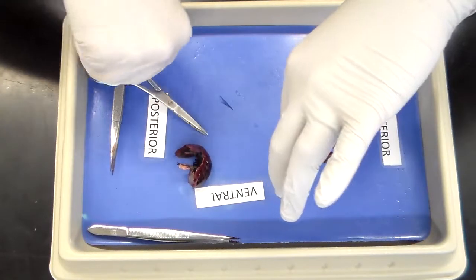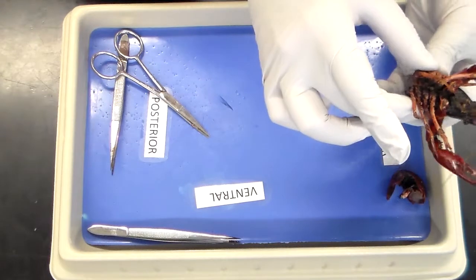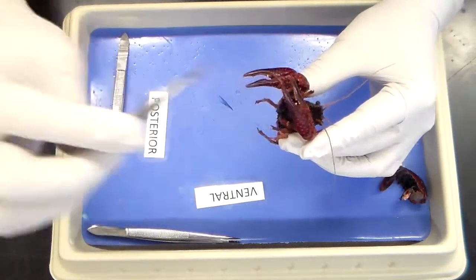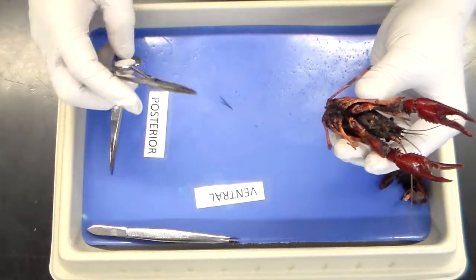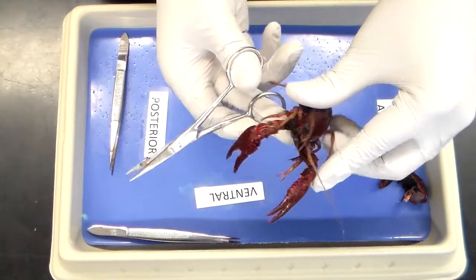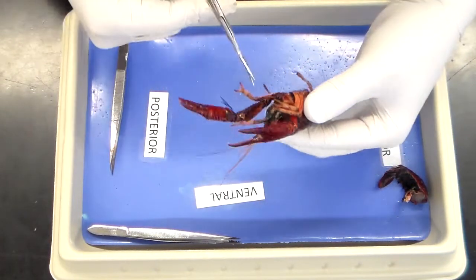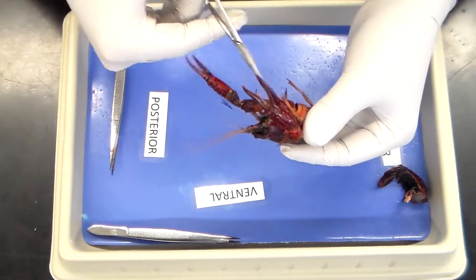We're going to set this aside. We always want to keep the crayfish anterior side up so that any digestive juices do not damage any internal structures. From here on out, we're going to find that cervical groove, follow it all the way down the mandible, and there should be a nice little spot.